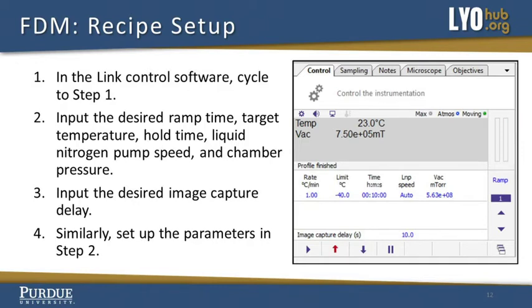Input the desired image capture delay. Images are compiled into a video file at the end of run. The chosen delay will be based on the desired temperature resolution. For example, a 12 second delay with 1 C per minute temperature ramp will produce an image every 0.2 C of temperature change. Similarly, set up the parameters in step 2.